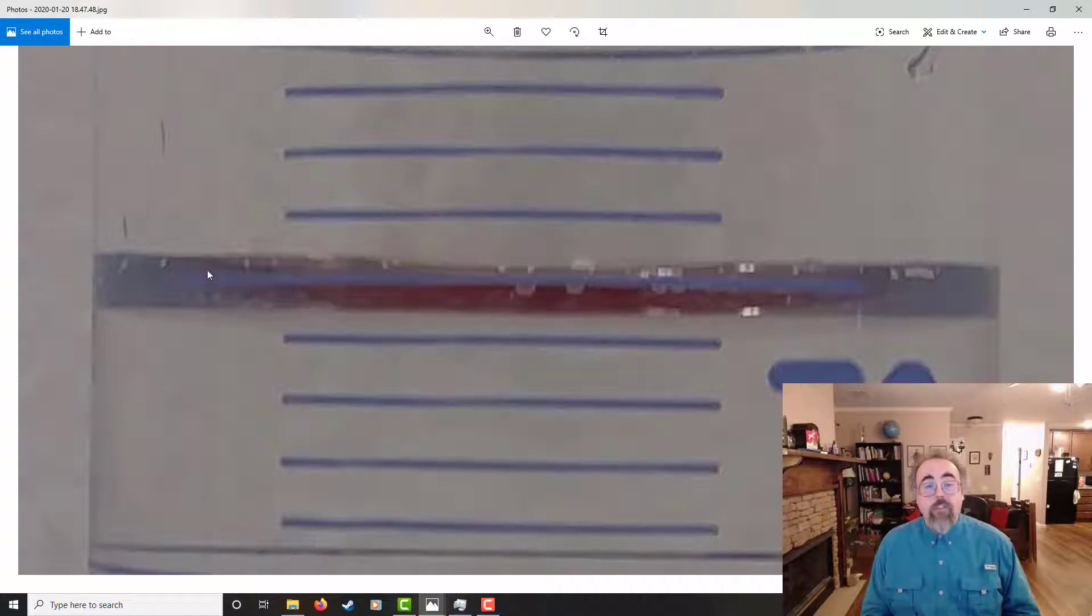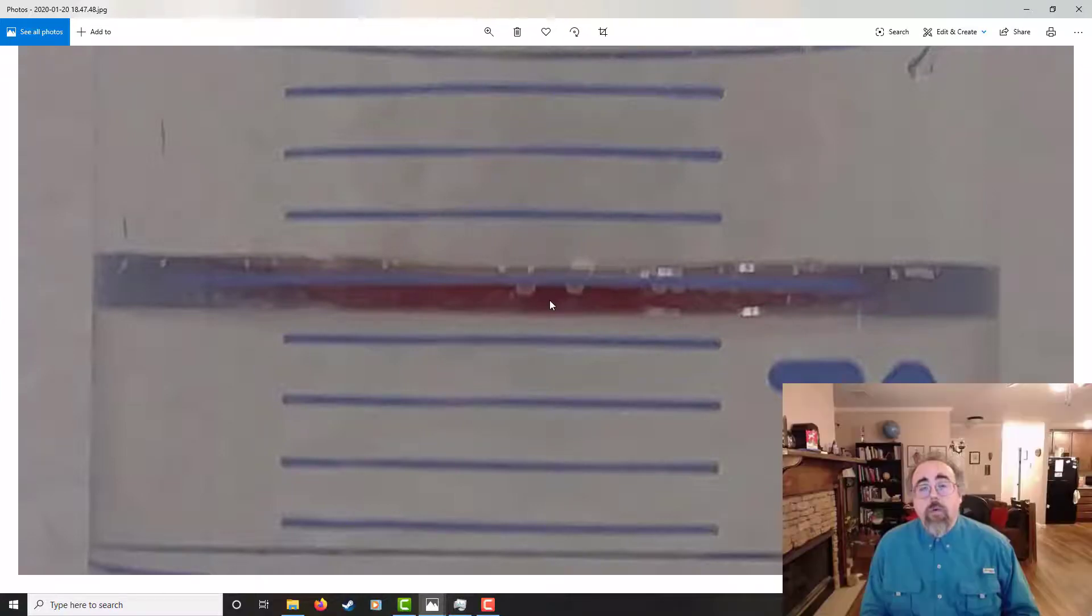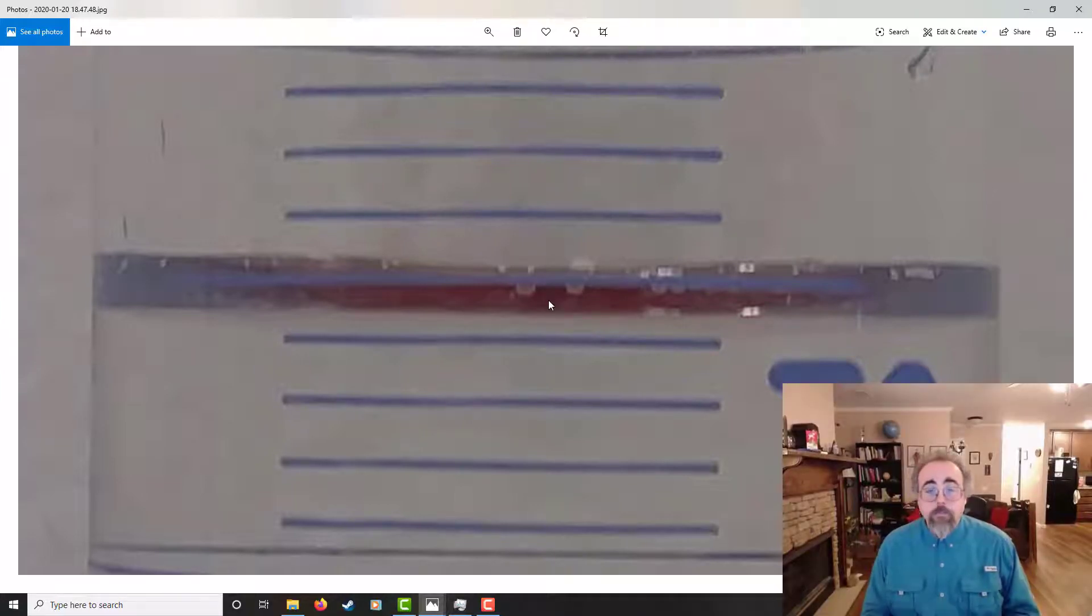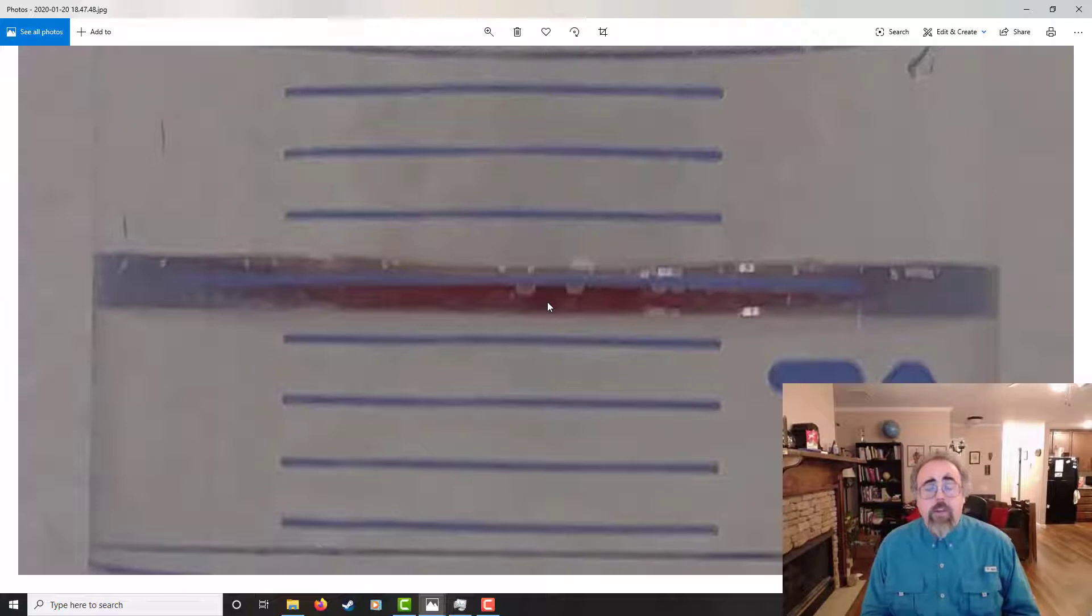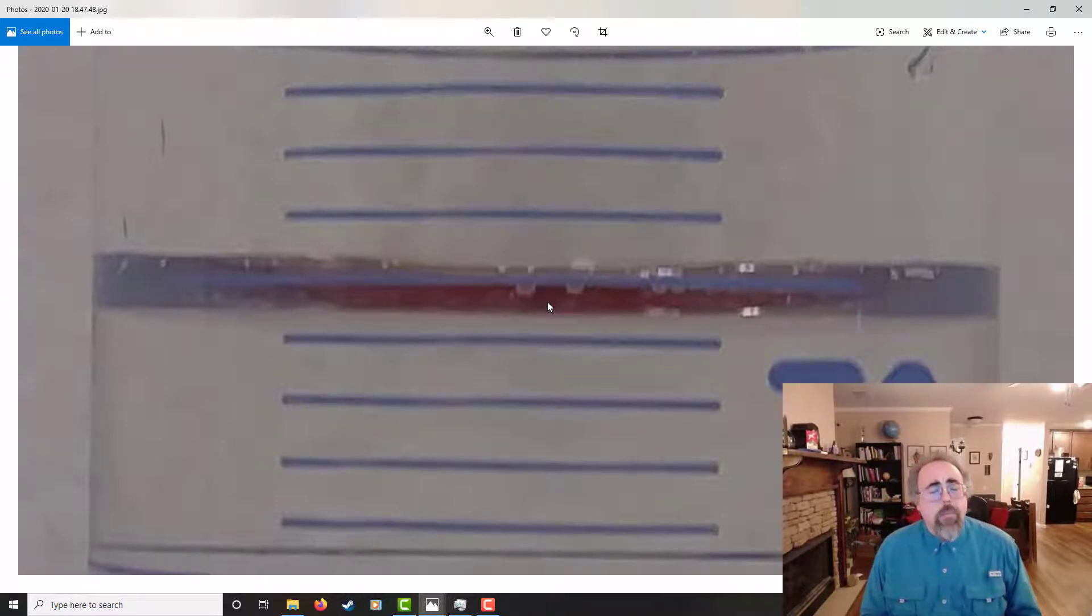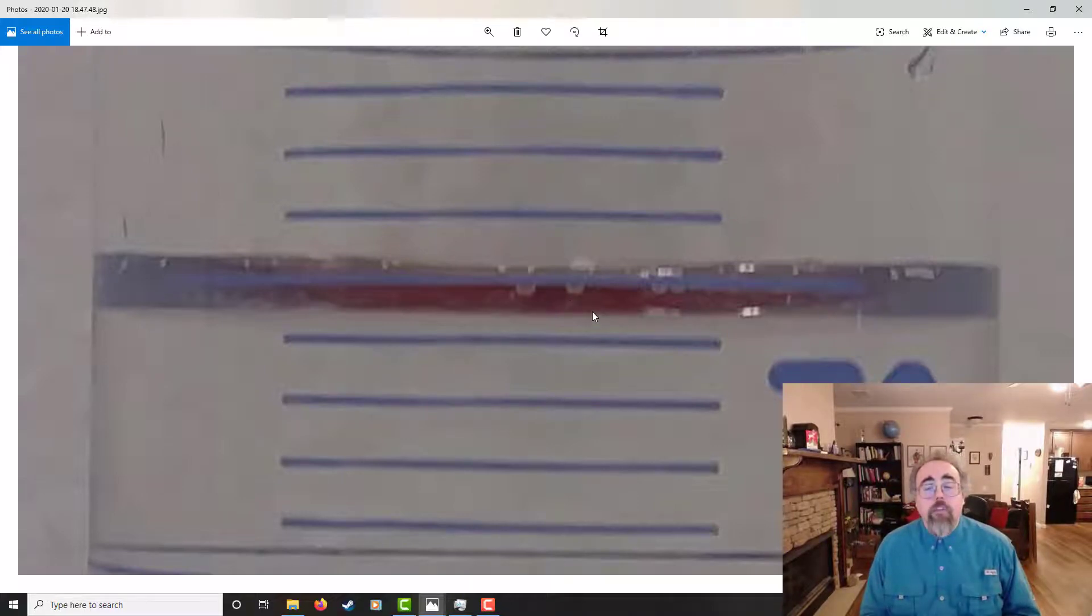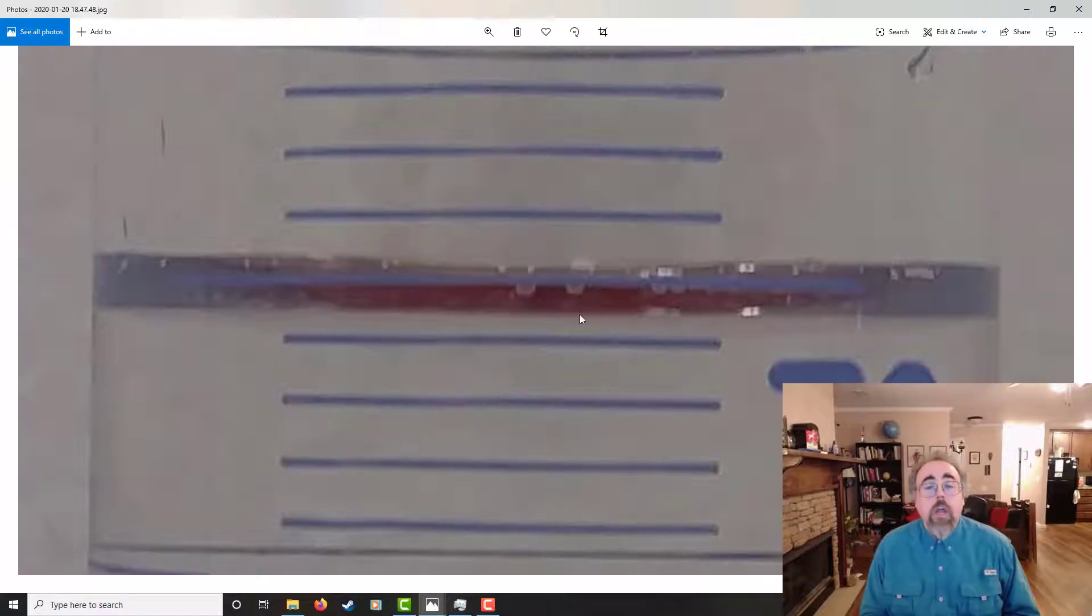Now, of course, the size of this meniscus is actually pretty large compared to the size of the marks. So what we've done as a society is that we've said, okay, for a scientific glassware, under normal circumstances, we're going to say it's going to be calibrated so that the bottom of the meniscus, this down part right here, is where we read from.